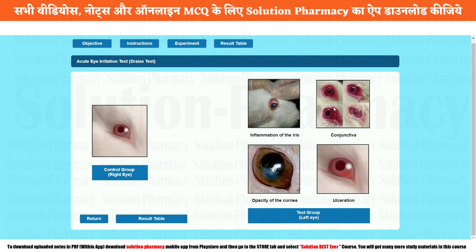This is the basic observation of that particular drug. That means our drug which we applied is not safe — it is toxic and irritative on the eyes. Now you can click on the result table.